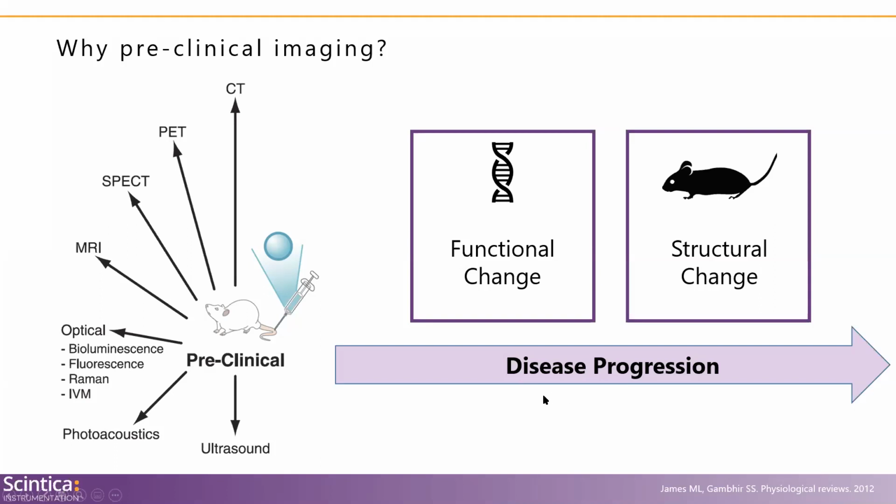Now, there's a wide variety of preclinical imaging tools to choose from. And really, there's a whole field now that's dedicated to instrumentation and technology development. And so this list continues to grow. But for the sake of today's webinar, we'll be focused on 4 of the most commonly used modalities in preclinical research. And again, this is positron emission tomography or PET, magnetic resonance imaging or MRI, optical imaging, and then finally high frequency ultrasound imaging.